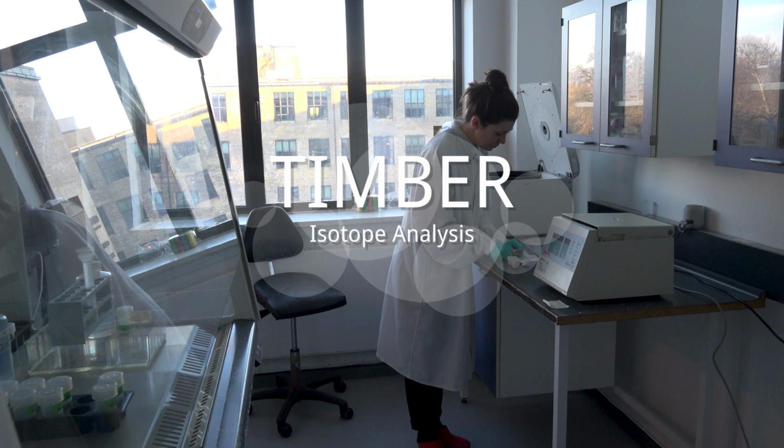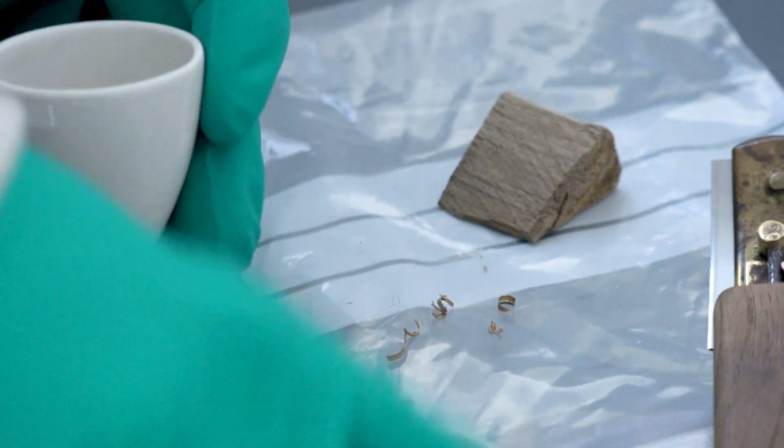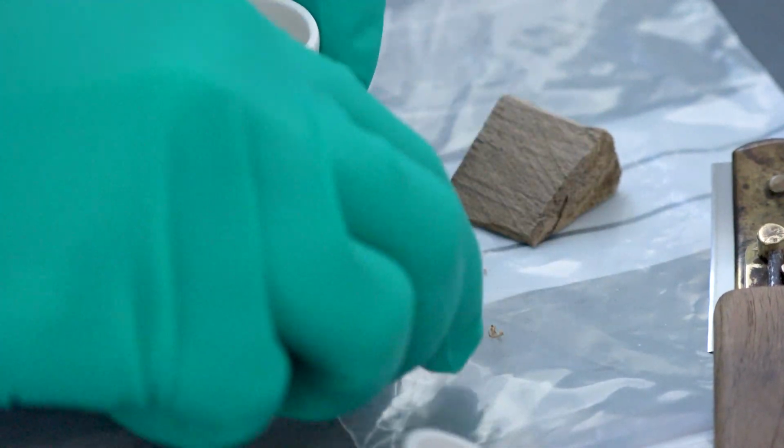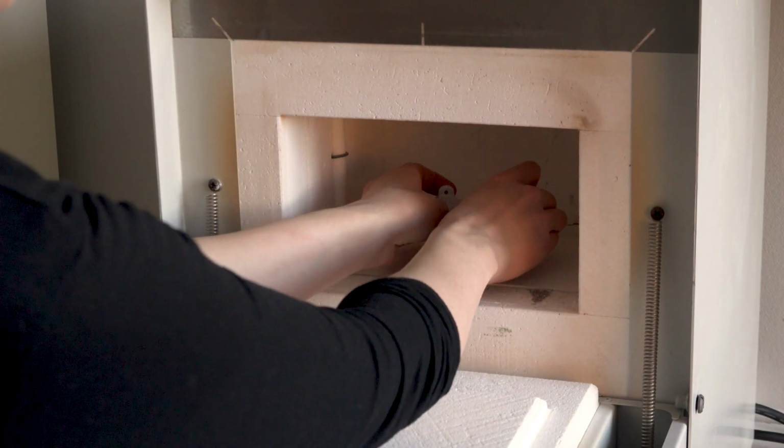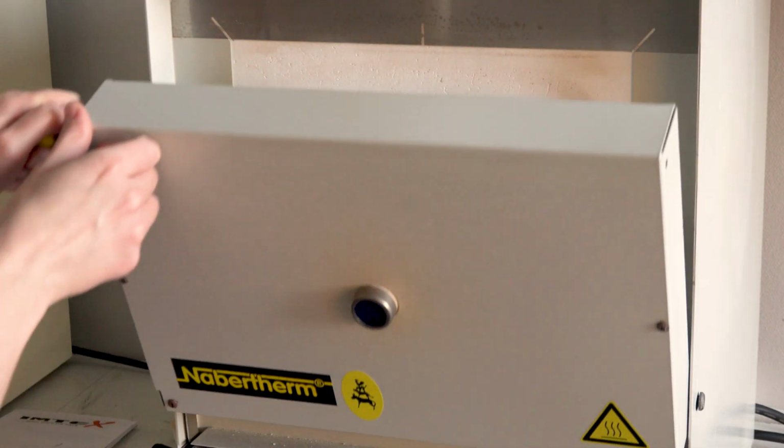So what I bring along is this isotope geochemistry background, and I use this as a method to provenance where timber came from, where archaeological timber came from, that was then used for shipbuilding. So what I actually do is I take samples and I see what values they have and how I can relate it to a natural environment to match up a potential origin of materials.